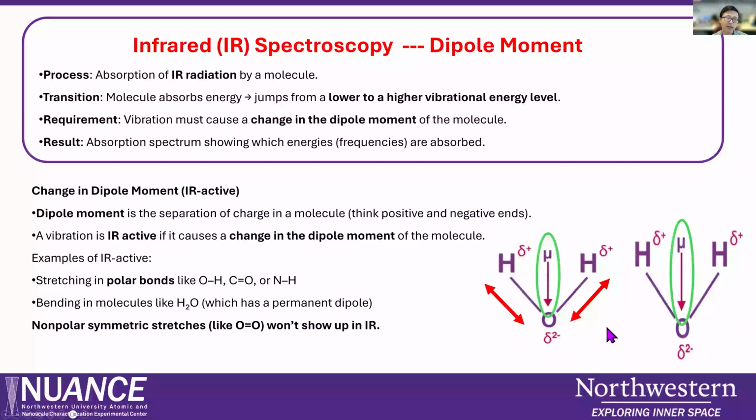They can measure this because IR energy is absorbed by this dipole moment change. Like OH and carbon-oxygen, these bonds have a big dipole moment. And also when they are stretched, the dipole moment changes, and then they have a strong peak for OH and carbon-oxygen.